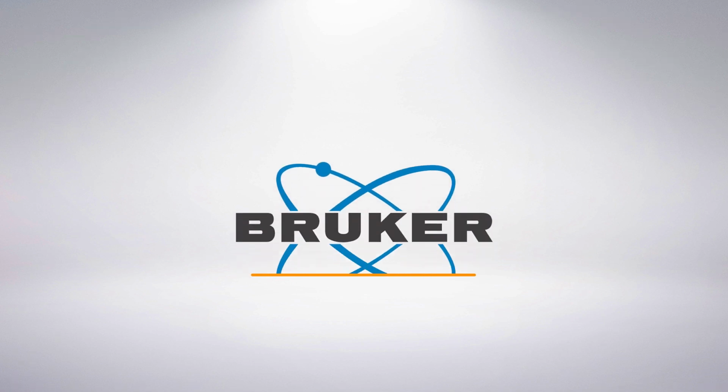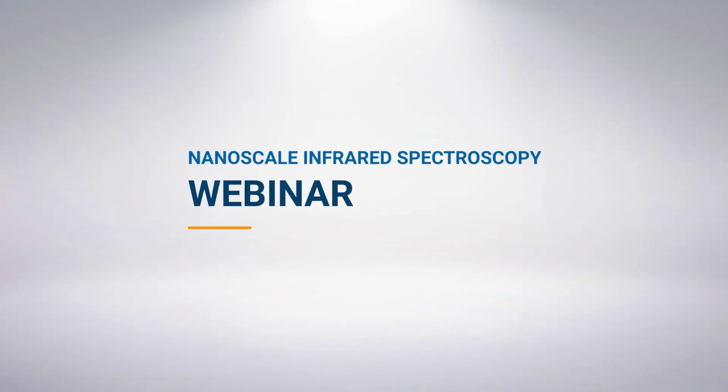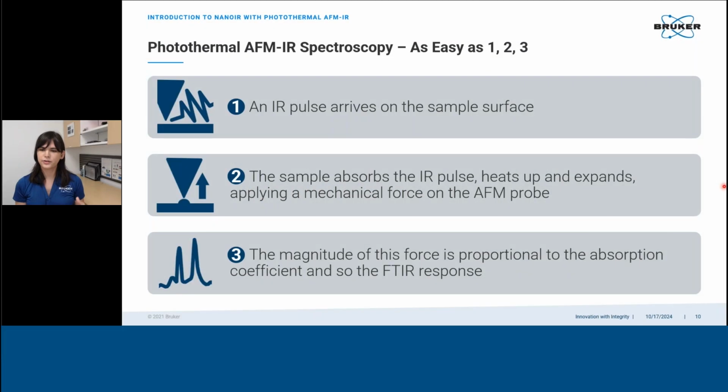To give you a sense of what's happening, we're sending this infrared pulse onto the tip sample area. That infrared pulse, if it is absorbed by the surface, is going to cause the surface to heat up and expand and provide a mechanical force onto the AFM probe. Again, we're going to be using that AFM probe as a pickup and using the resonance frequency of it to amplify the signal that we're detecting there. So even though it's very, very small, we're able to detect it readily.